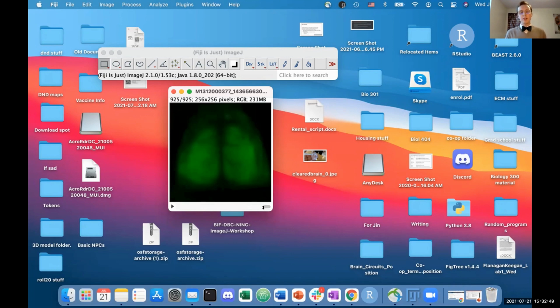So now we are going to create our macro to calculate DFF for this XYT stack. I'm going to go through the first couple of steps, and then I'm going to leave it to you guys to try and figure it out. I'm going to give about 3 minutes for the first page of instructions on the PowerPoint, and then another 7 minutes for the second page, as that page is quite a bit more difficult to go through.